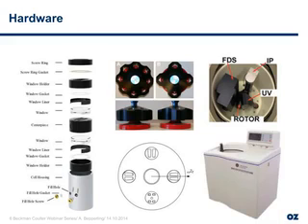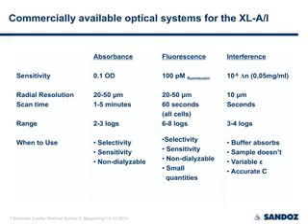The absorbance system is sensitive to chromophores, of course, mainly the aromatic amino acids in the analysis of proteins, or mainly antibodies, which is the main topic in biopharmaceutics, whereas the interference optics is not sensitive to chromophores, but records every contribution of the signal, including buffer components, and usually we don't have the possibility to use dialyzed samples, although interference optics has some distinct advantages, especially in the high concentration range. I will show an example later on.